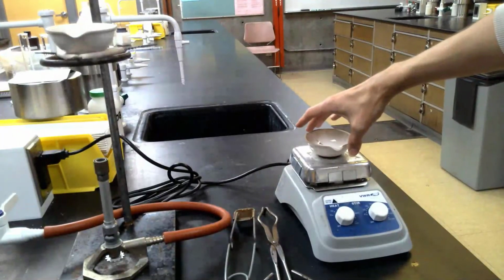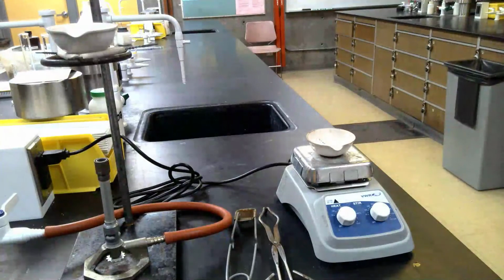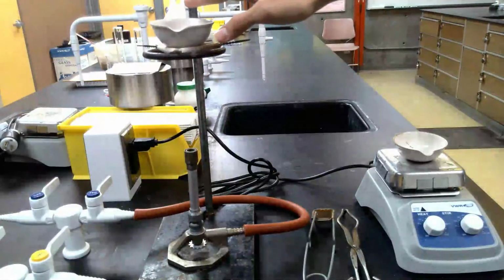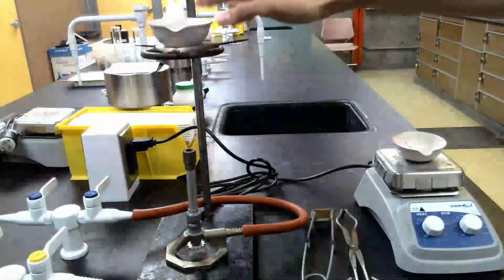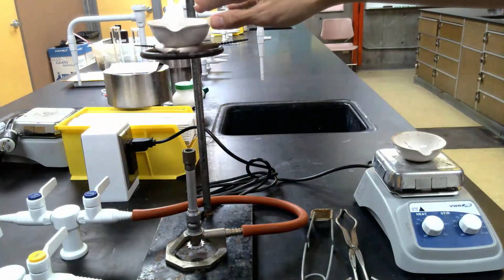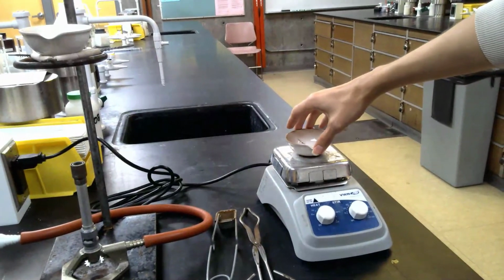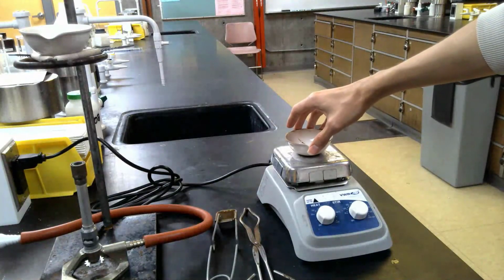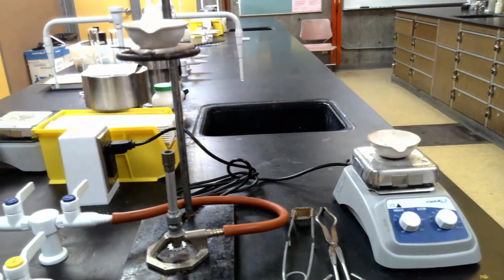The sand that was left behind after I decanted the salt water, I've got that on a hot plate. And so here, I'm going to evaporate the water, use a Bunsen burner to drive the water off, and what I'm left with in this evaporating dish should be just salt crystals. Here, once I've heated it thoroughly, all the remaining water should be gone, then I should have nothing but sand in this dish.